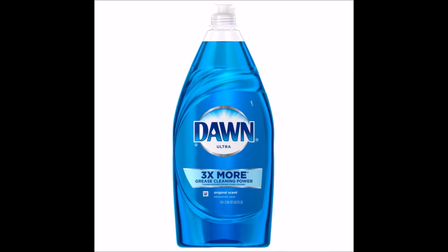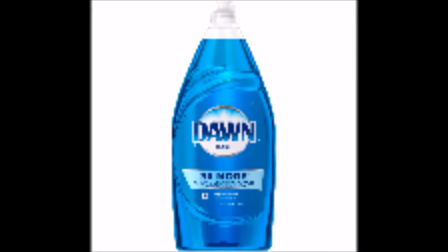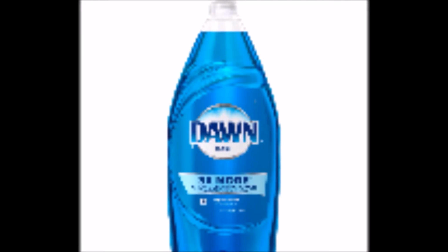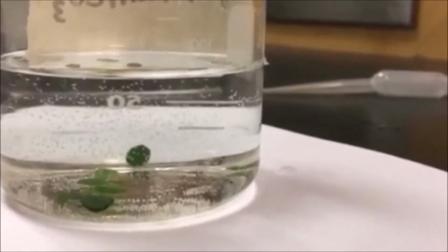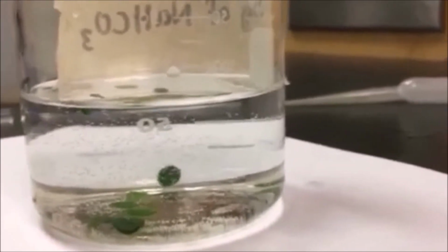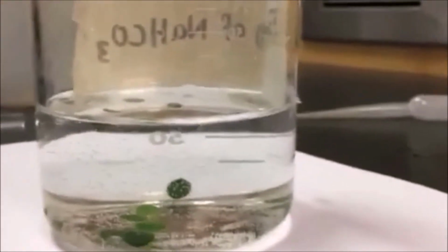When we place the leaf discs in the sodium bicarbonate solution, the leaves will sink. Then, we will observe when the leaves will rise due to the production of oxygen due to photosynthesis. The reason we create a vacuum is like the reason we use soap. This is to get rid of oxygen, allowing the leaves to be less buoyant before we add them to the sodium bicarbonate and soap solution. Once we add the leaves to the solution, they sink. As photosynthesis occurs, the oxygen produced will cause the leaves to rise. We receive better results because the rising of leaves is due to the production of oxygen.